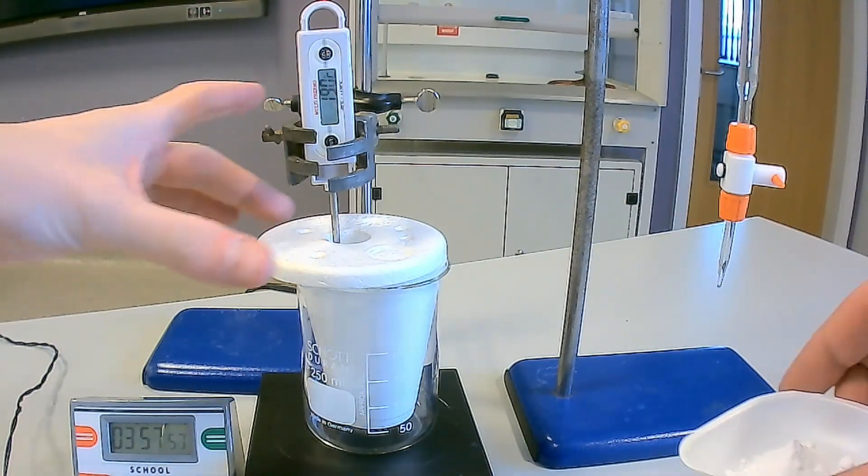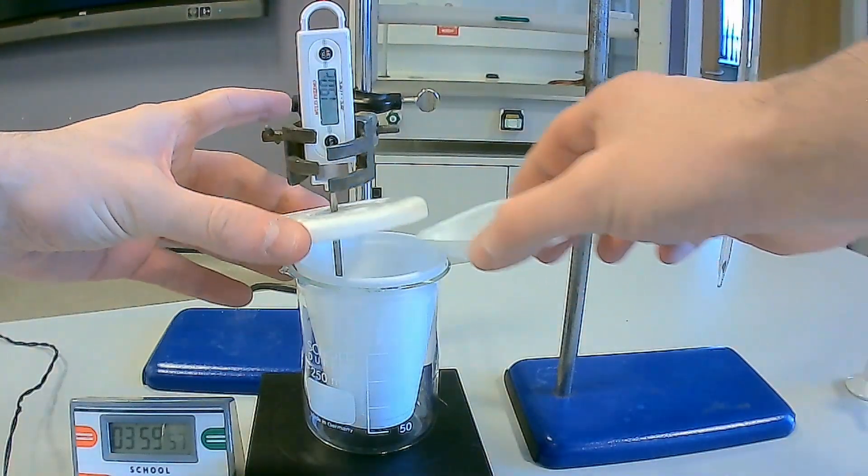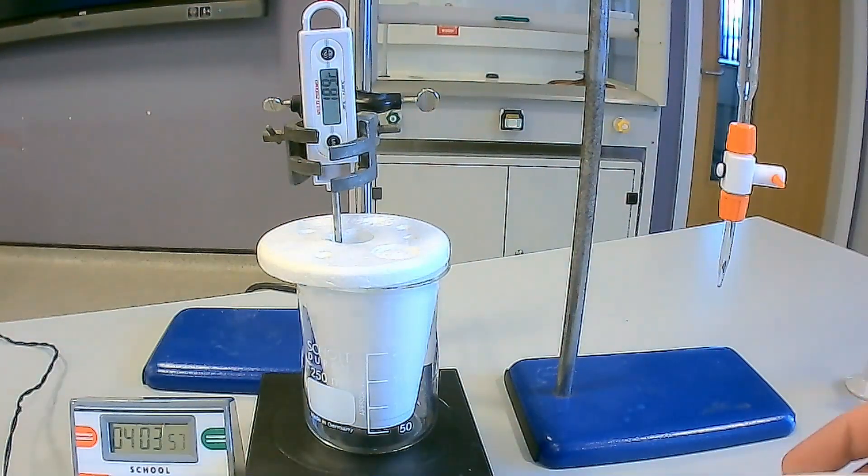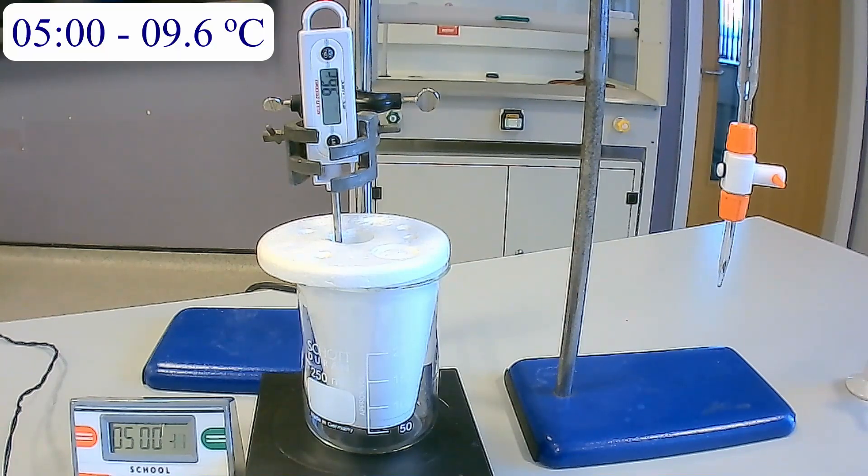At 4 minutes on the stop clock, do not record the temperature. Instead, lift the lid and add the sodium hydrogen carbonate weighed earlier to the polystyrene cup. Take care as effervescence will be observed, then replace the lid. At minutes 5 to 10 on the stop clock, record the temperature shown on the thermometer.